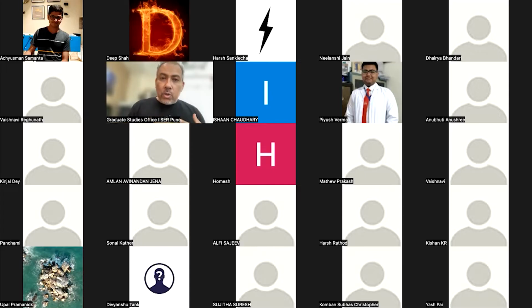Okay, now there are tools, for example, and I didn't get into that here, where you can combine a fluorescence image with something like an electron microscopy image, right? And we didn't talk about electron microscopy at all here. And electron microscopy clearly is probably the benchmark for a lot of the imaging that you want, because of the quality of the image that you get, right?